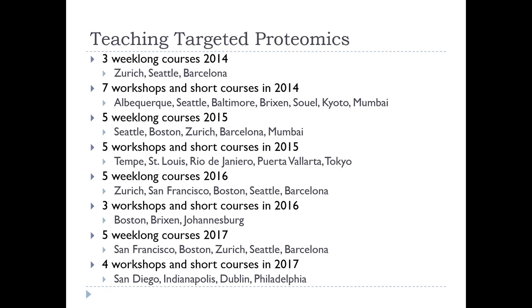But also with the realization that we were one of the leading targeted proteomics labs with one triple quadrupole, and Skyline could only do SRM, I think we realized that targeted proteomics wasn't a viral idea. It wasn't like Facebook or anything. It took a lot of teaching to get people to understand targeted proteomics and how to do it, how to apply it.